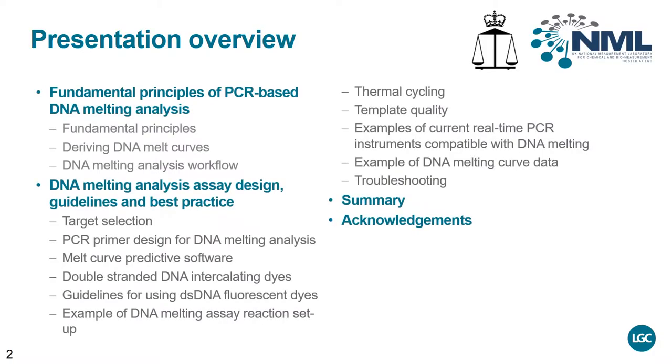This e-seminar will provide you with a general introduction to PCR-based DNA melting analysis as a method for food authenticity testing, and provide guidance on how to design, implement and analyse PCR DNA melting assay data.